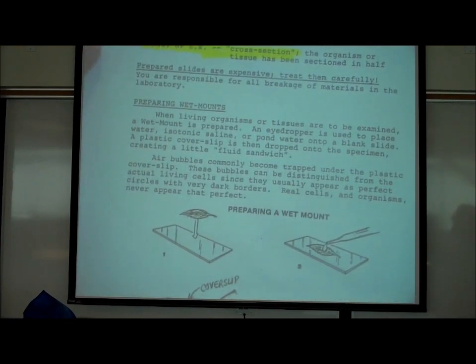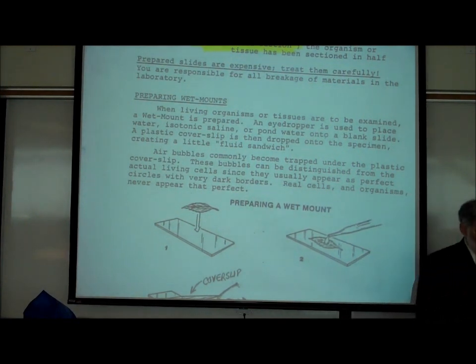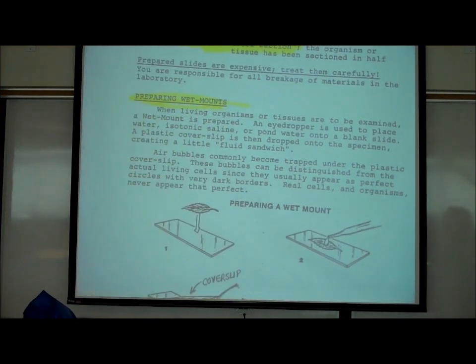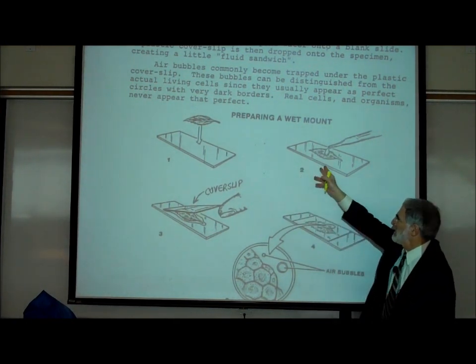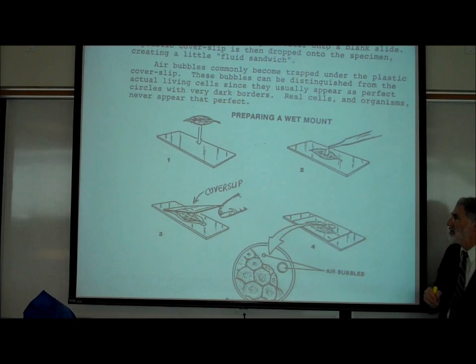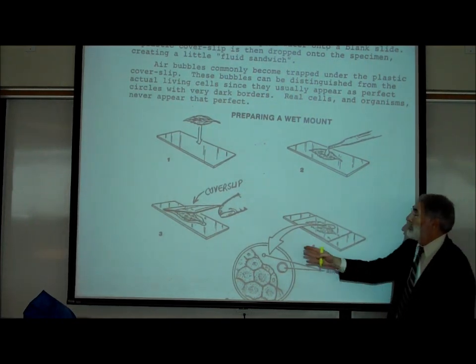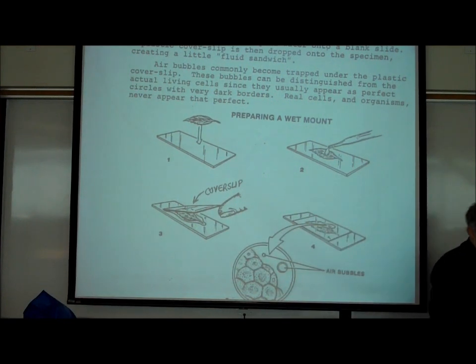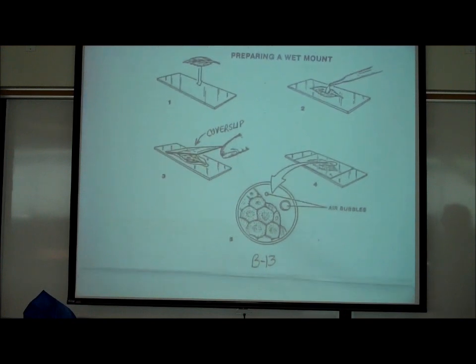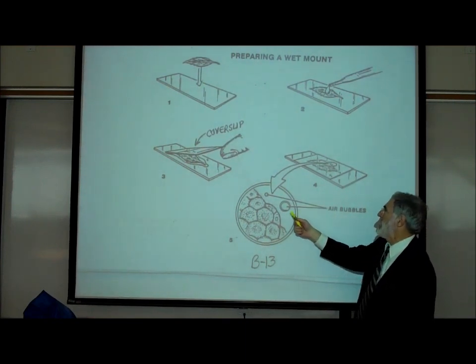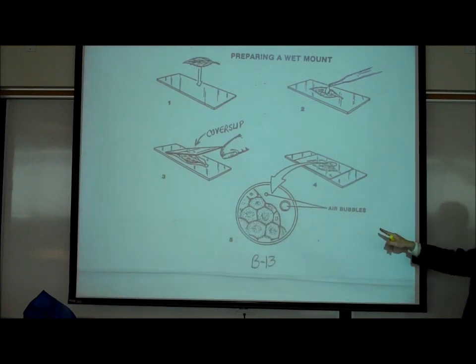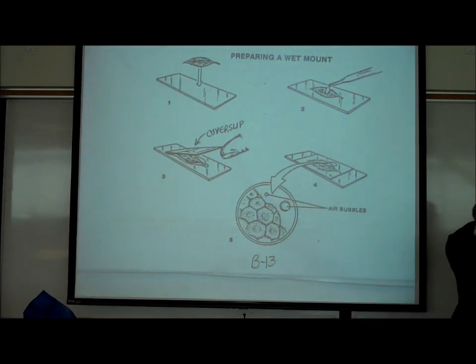When we look at something alive, we usually put water on it — that's called a wet mount — because without water, it will die. When preparing a wet mount, you place a cover slip on top to keep the water from moving off the slide. Whenever you drop a cover slip onto a slide with water, you always get some air bubbles. If you see perfect circles, those are not cells — they are air bubbles from the wet mount process.